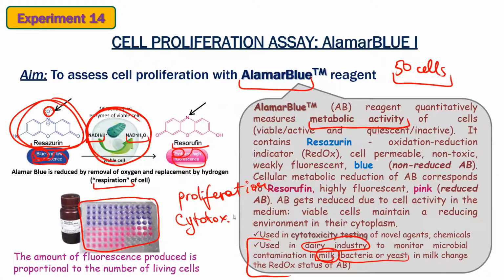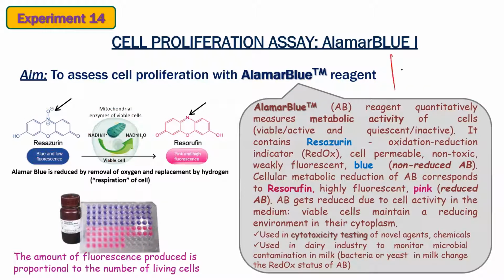Okay, so about this cytotoxicity, how is it done? We have a pharma company that is developing a drug, and the drug is developed on the basis of many other molecules.